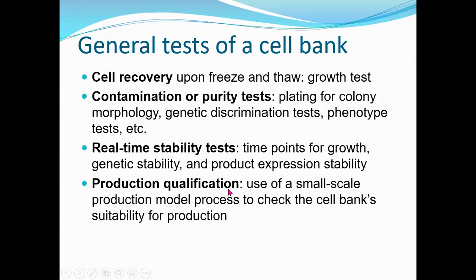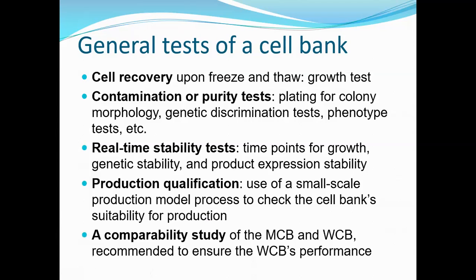Then product qualification, and we initially use a small scale production model to check whether this cell bank is suitable for the larger scale production or not. Then obviously you perform a comparability study of the MCB and the WCB to ensure that the WCB is working fine.